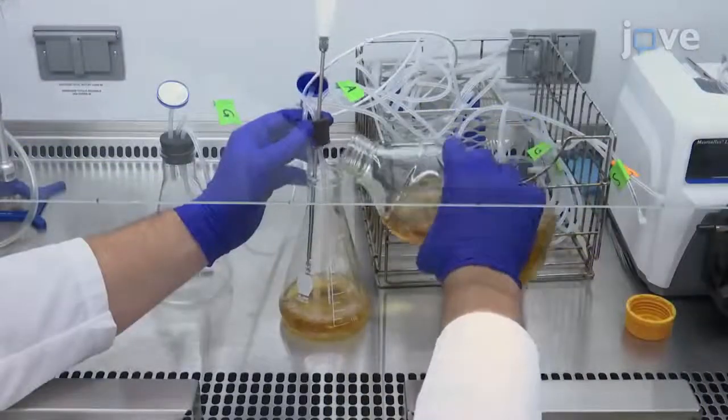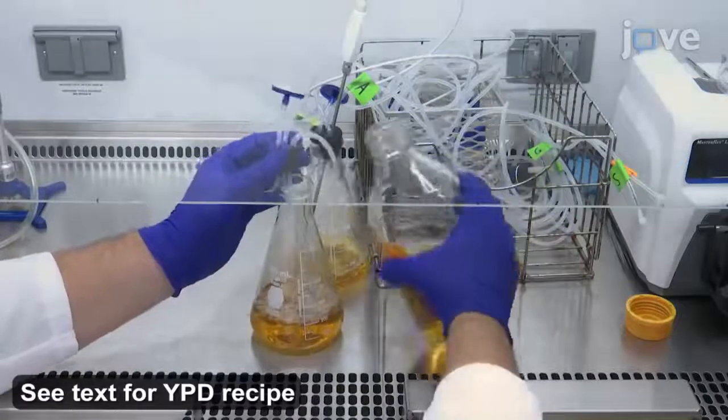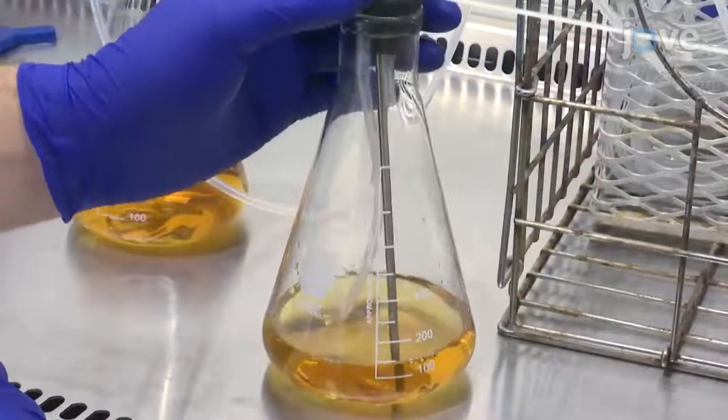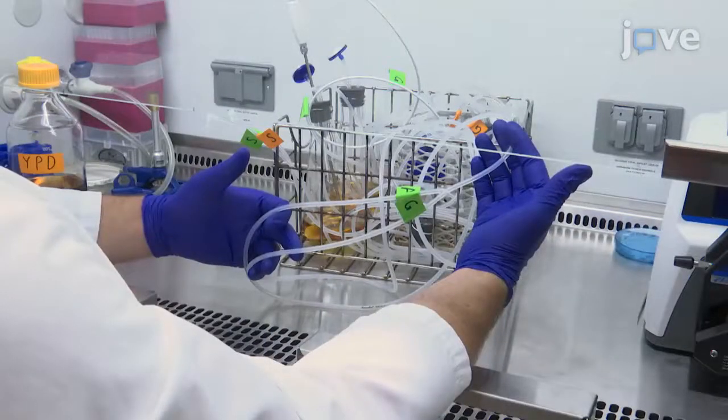Fill the attachment flask with 100 milliliters of YPD, and fill the growth flask with 200 milliliters of YPD. Ensure that the green side tubing reaches the media in each flask. Ensure that all valves are open.